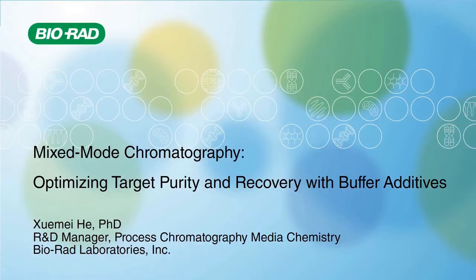Today, I'm going to talk about the use of buffer additives in mixed-mode chromatography for the optimal target purity and recovery.